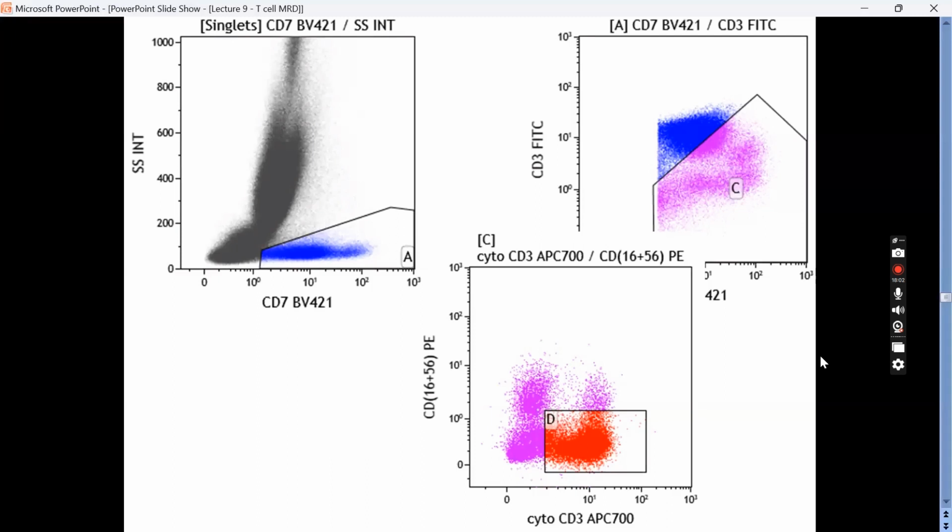You see the markers here. This is taken from a paper from Dr. Prashant Ambare: expression patterns of various markers in leukemic blasts in T-ALL patients from MRD samples. You find almost 8.2% of the cases showing a heterogeneous expression of cyto-CD3. So when I use cyto-CD3 as a gating marker, I may not be able to gate the entire T cell population. Only half of them will be gated and taken for further analysis, missing the bulk of the MRD. So I prefer CD7.